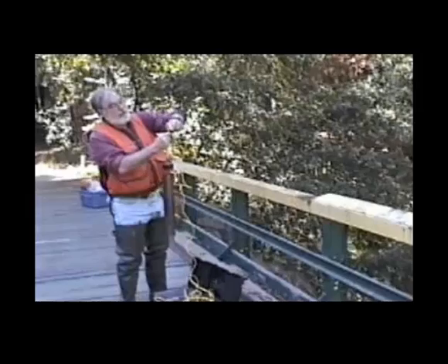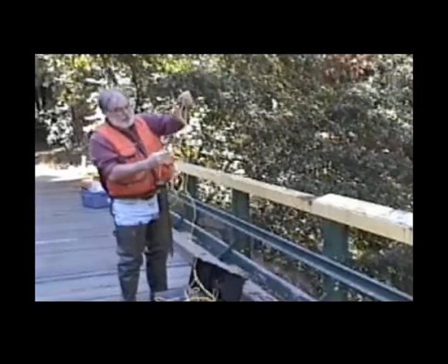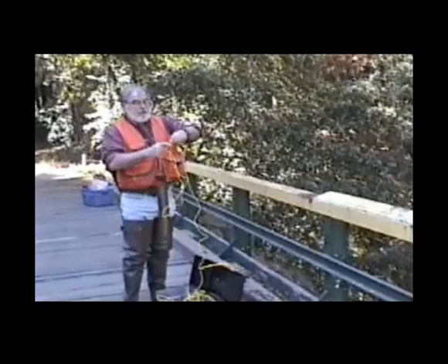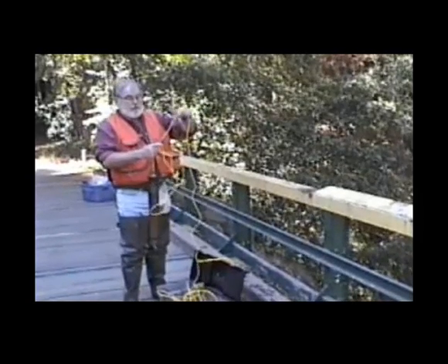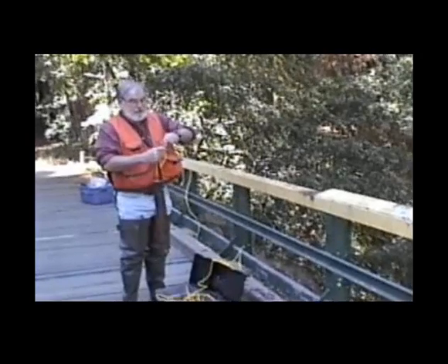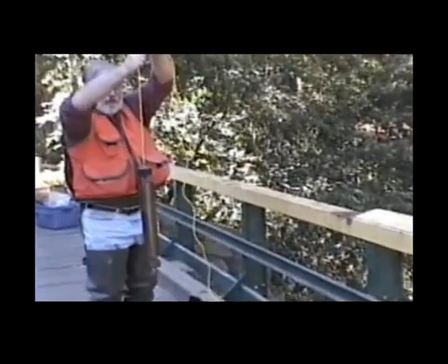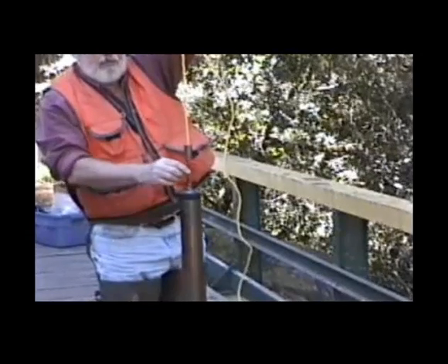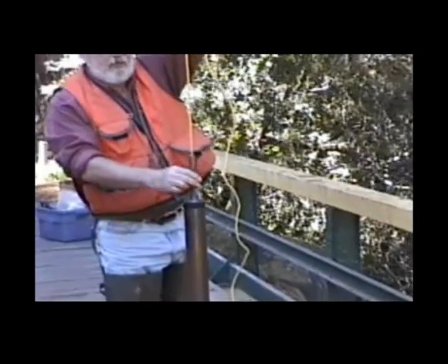You can't see it very well, but it's a black mark that's 1 meter. And when it reaches the desired depth, a brass weight called a messenger is lowered on the line. The messenger strikes the opening device and the sampler closes, trapping the water at that desired depth.